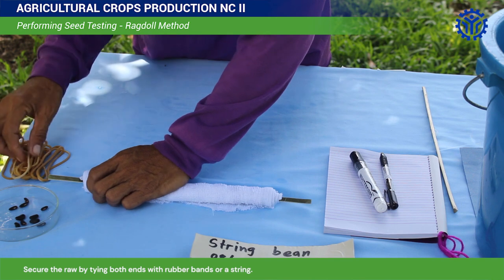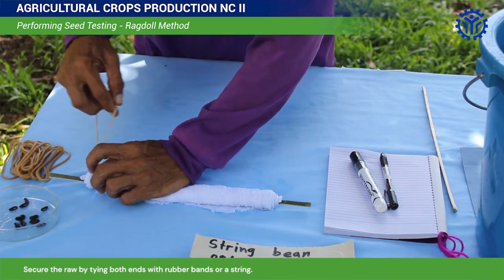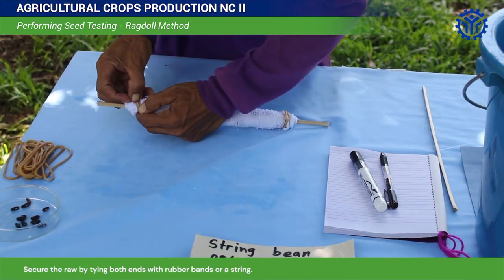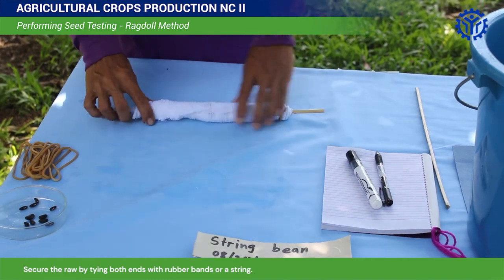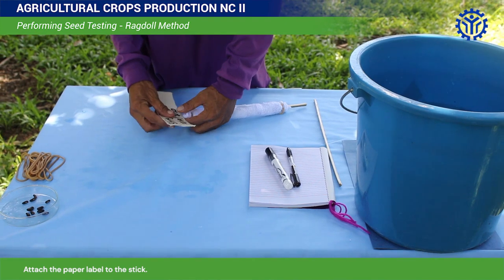Secure the roll by tying both ends with rubber bands or a string. Attach the paper label on the stick.